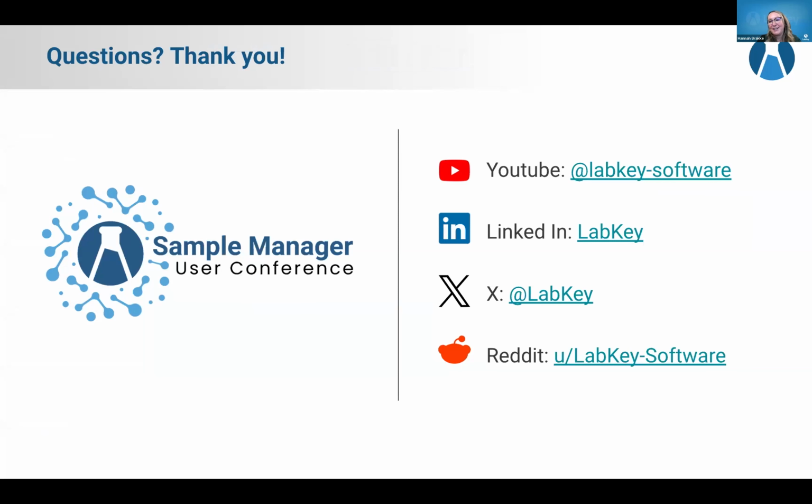Yes, all of what I showed today is part of Sample Manager Professional. And so if that's of interest to you, definitely get in contact with Jason or Lance if you're at that starter level instead.